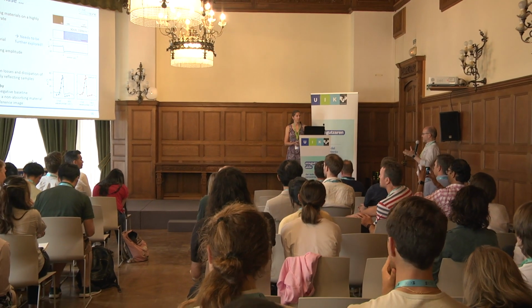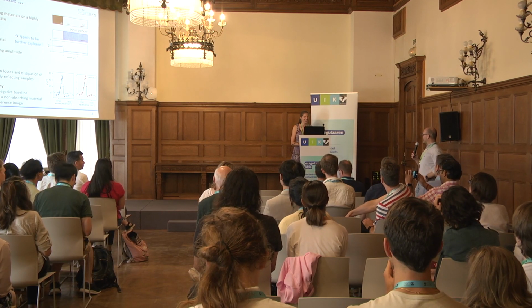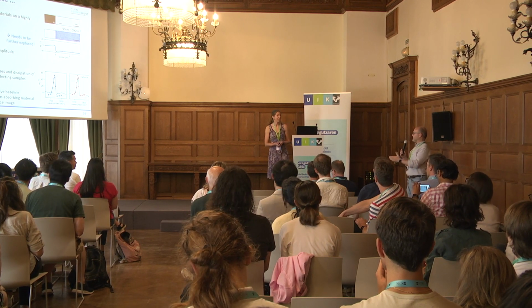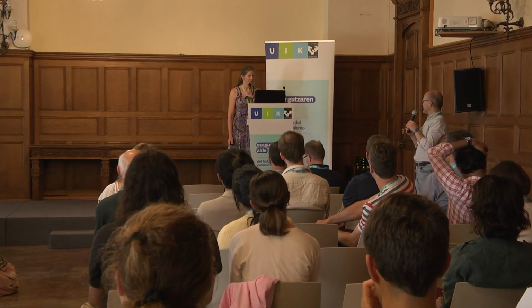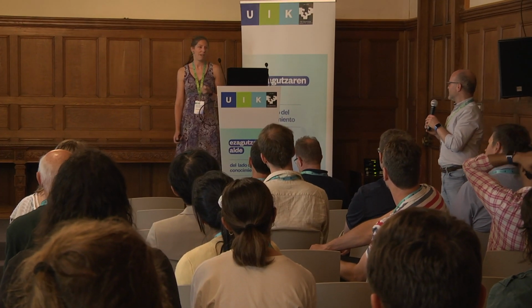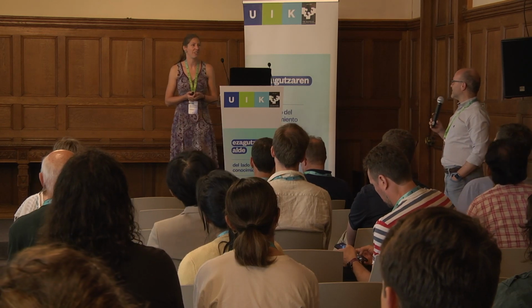So the trick is to look at the signals, right? I mean, not unbalance too much with respect to the material you are interested in. And also that in principle, especially the referencing to a non-absorbing material, you can have a different sample, right? It must not be on the same exact sample. Well, I would say it's better if you have it on the same sample, because as soon as you change some measurement parameters, it will also influence the negative phase.